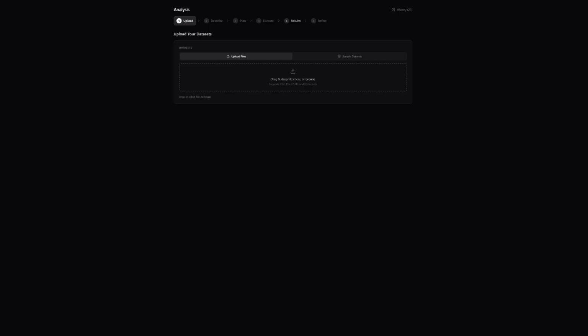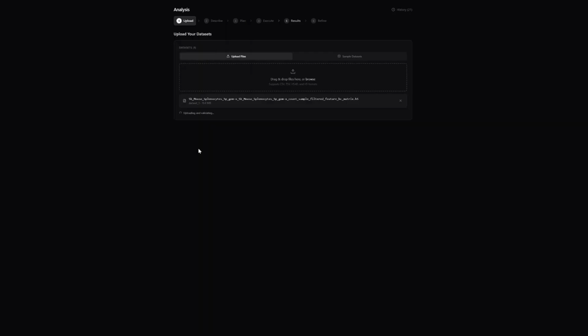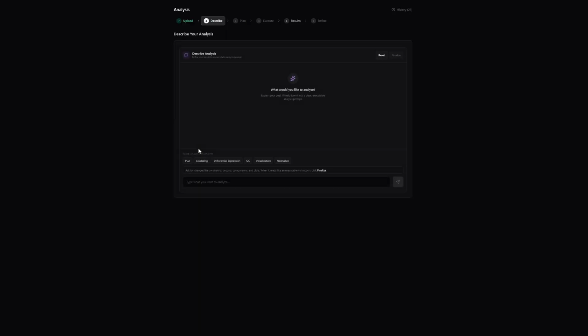So, to start, let's upload our data. Geneonaut supports multiple formats: H5AD, H5, CSV, and more. Let's upload our dataset. Now that our dataset is uploaded, we will have to describe our analysis.